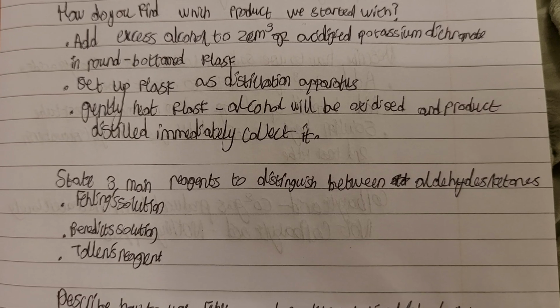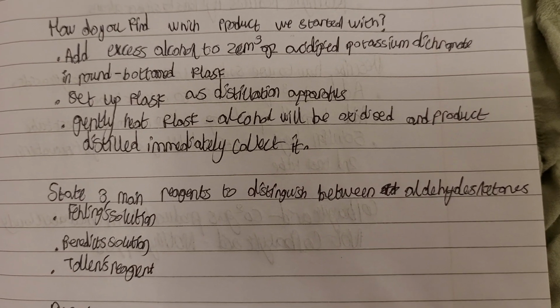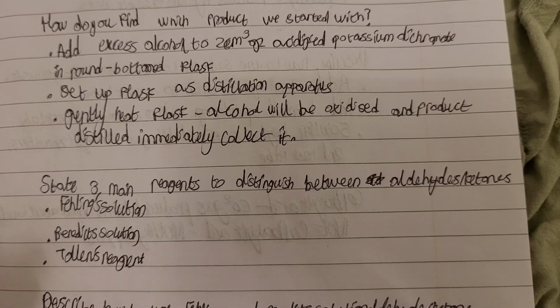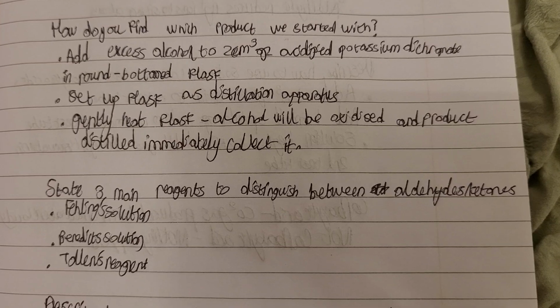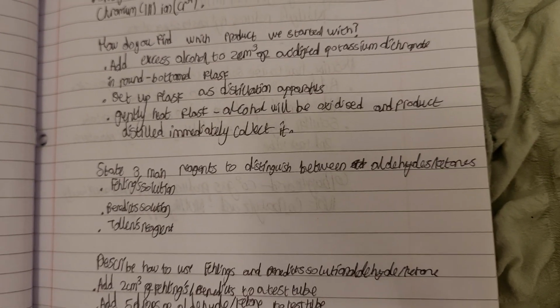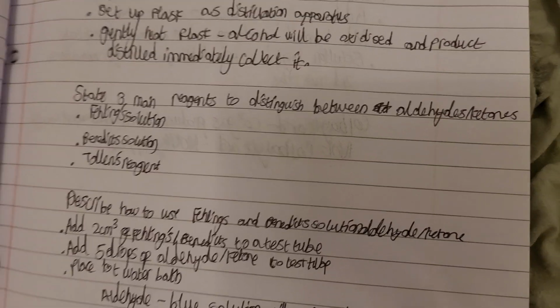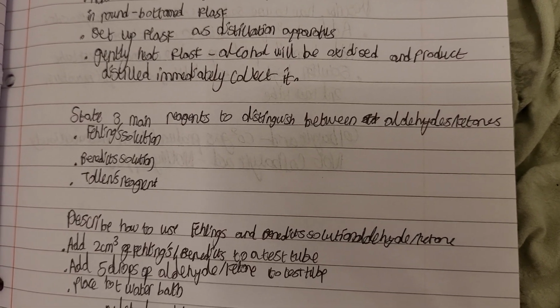Set up the flask as distillation apparatus, which I will go through, along with drawings of the apparatus, in a separate video. Then gently heat the flask. The alcohol will be oxidized and the product distilled immediately, and therefore we can collect the product.